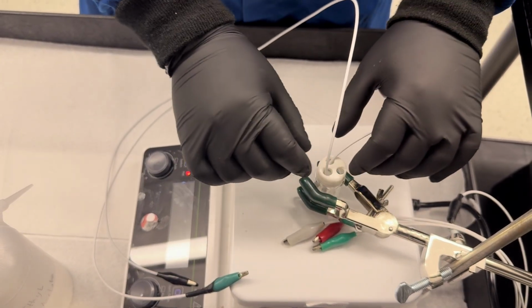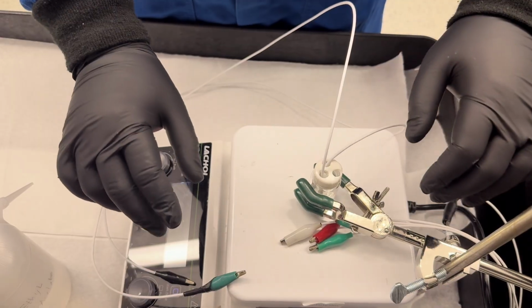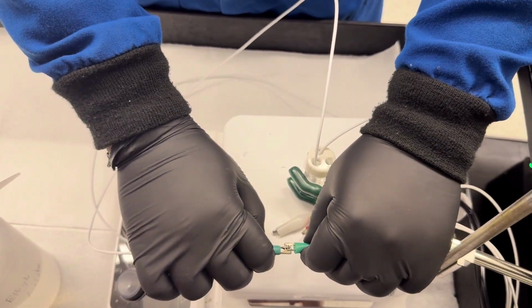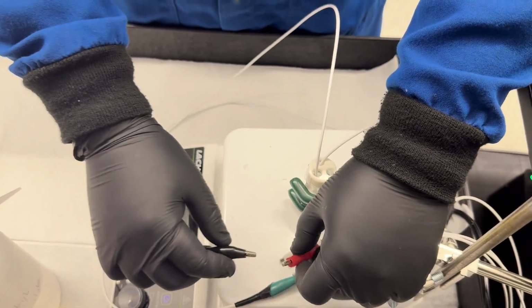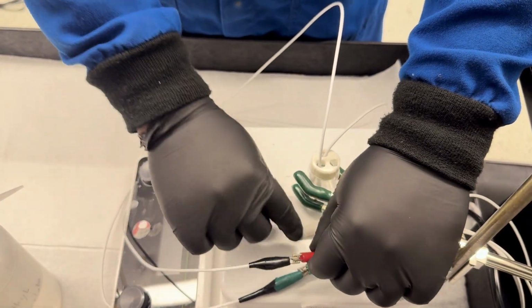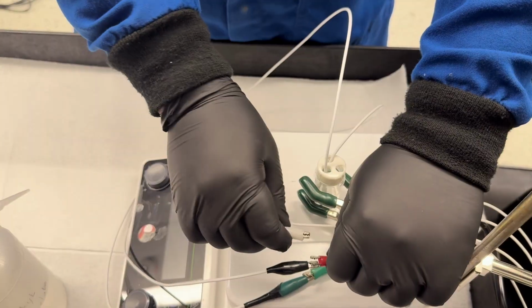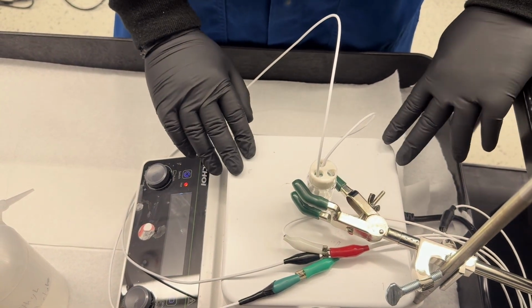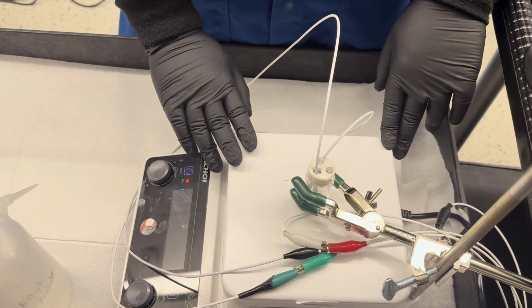When they are dipped in the solution and not touching, we connect the cathode to the working electrode and the anode to the reference and the counter electrode, because it is a 2 electrode setup. So we connect the reference and counter electrode together. After we connect it, we set up the potentiostat and run the reaction for 16 hours.